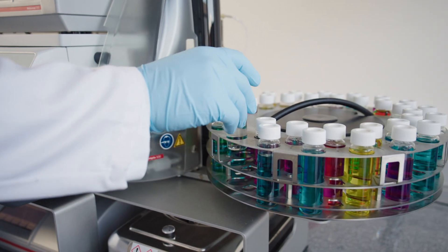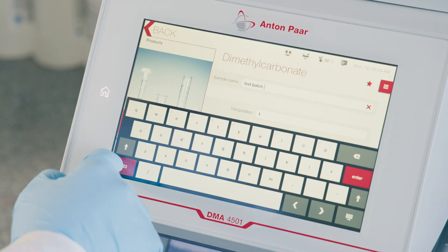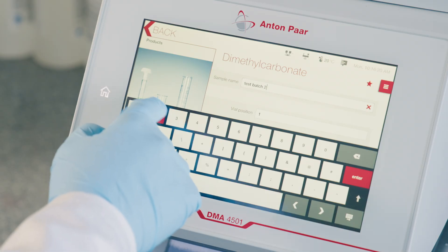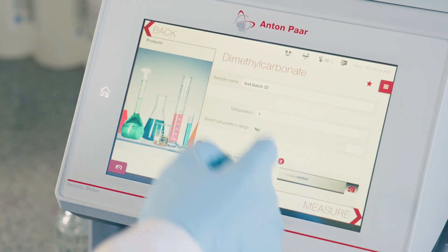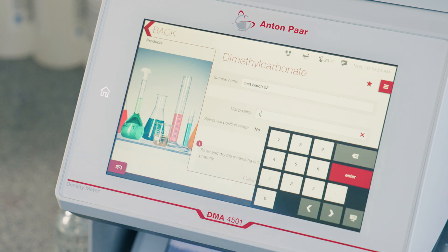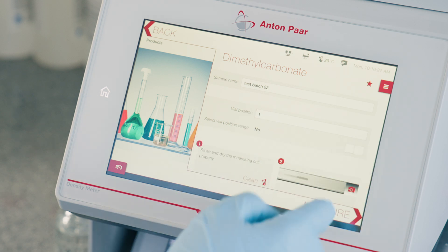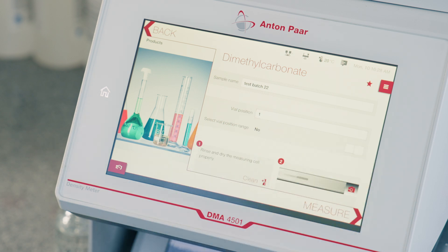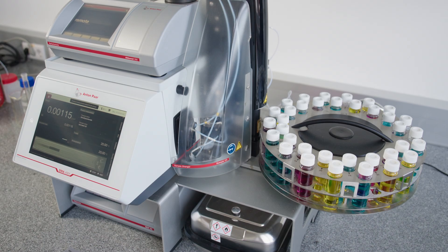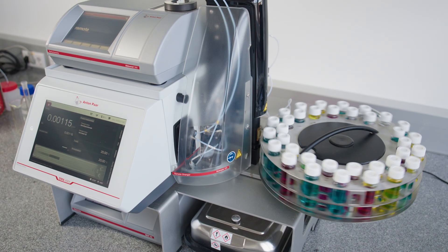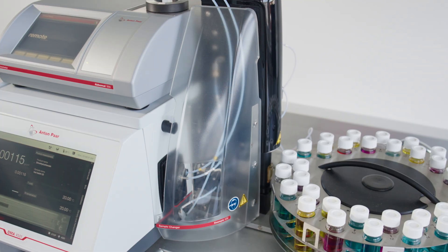Insert the sample in a specific position in the sample rack, then type its name and position. Measurement time will depend on the number of parameters measured and the precision level required. For a precise measurement monitoring density and refractive index, measurement time is about 4 minutes.